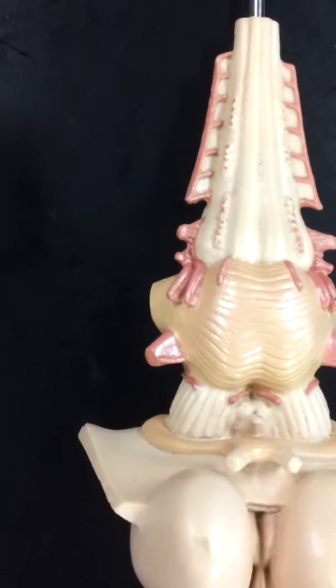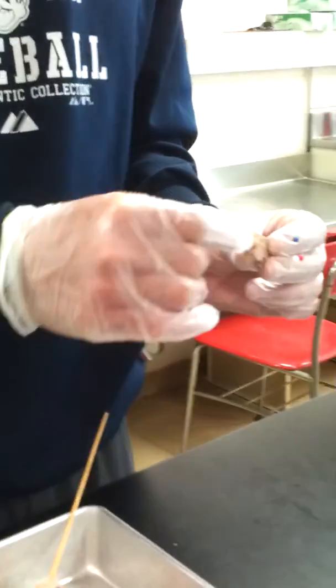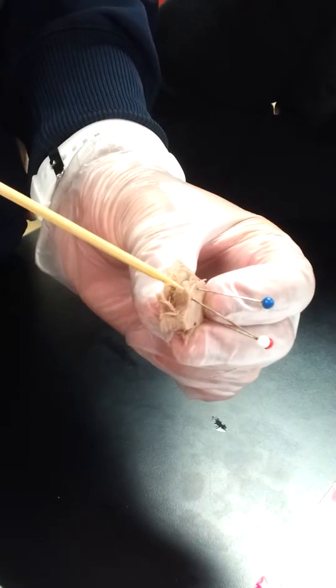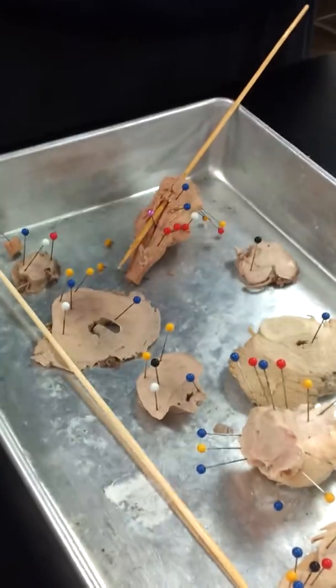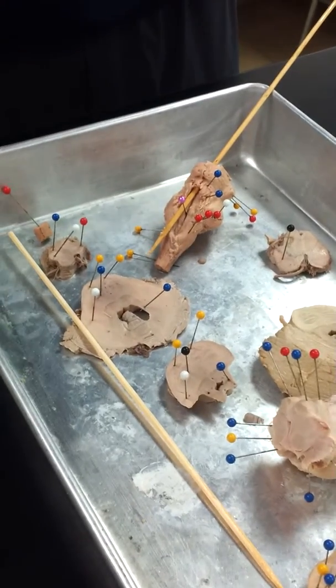You can see hypoglossal. You can actually see it on this one because it sits in between your medullary olive and your medullary pyramid. So that's what these little strands here are. That's your hypoglossal nerve. This is your olive. This is your pyramid. Cool, huh? It's just small. I don't really think it's fair to ask you unless you really know.